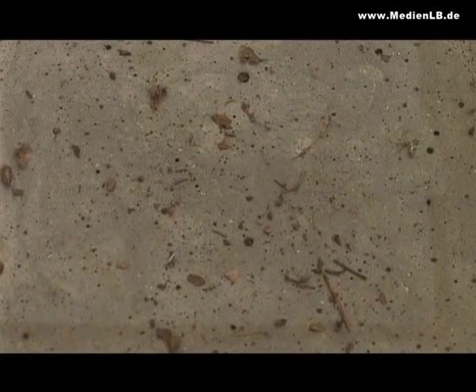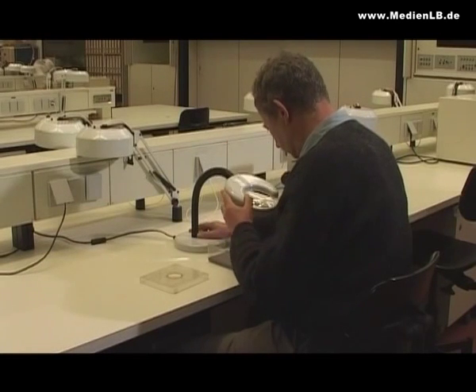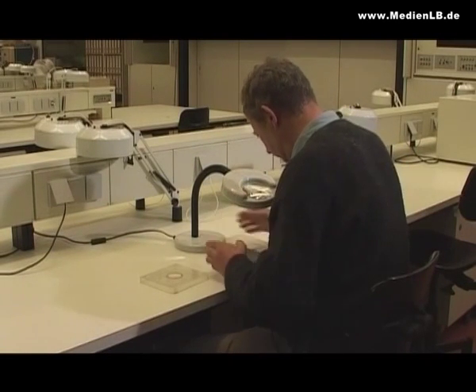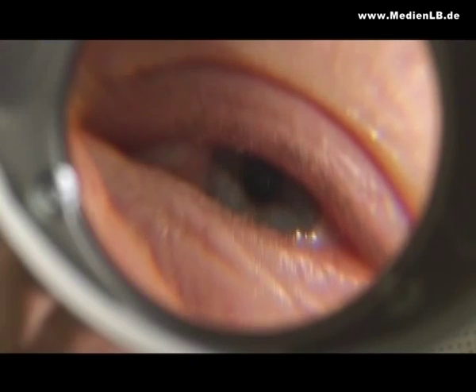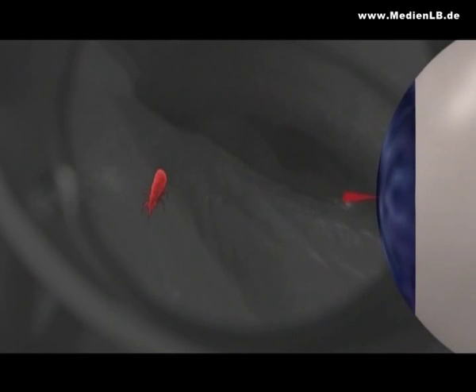To be able to see small specimens which we cannot perceive with the naked eye, we use a magnifying glass. A magnification of up to 15 times is possible with it. First, the specimen to be looked at is captured from a particular visual angle.